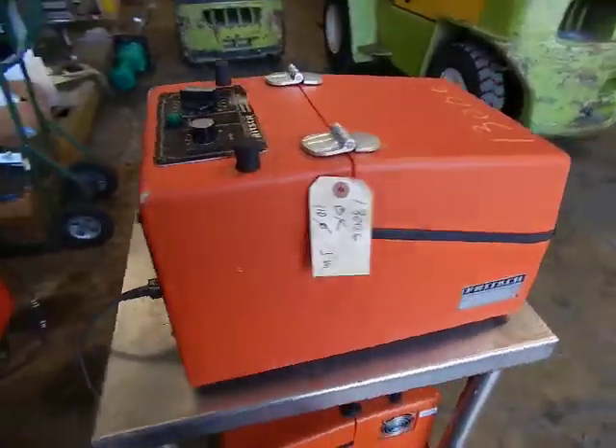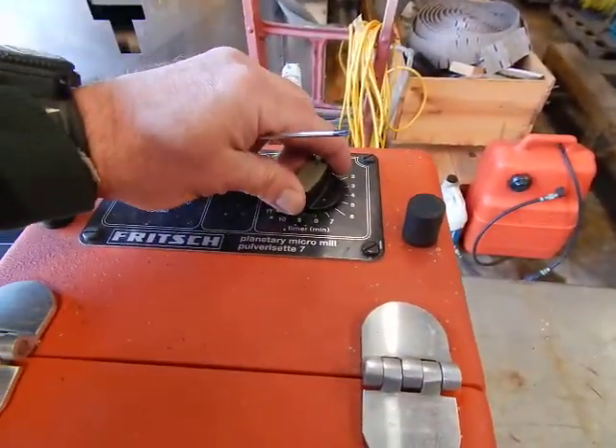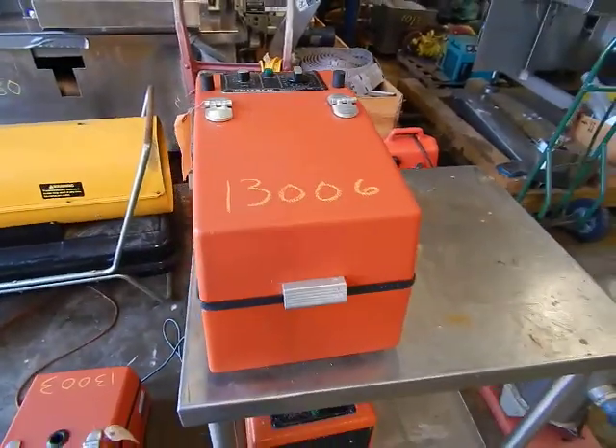We'll send this over to you with a link so you can take a look at it right now. Let's just show you one more time — take the timer off. There it goes. Hope to hear from you soon.